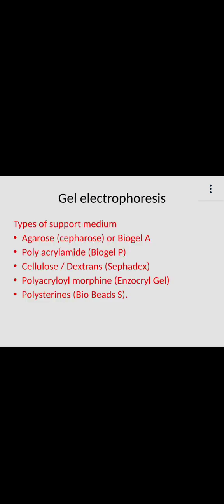So our two interests of electrophoresis, we only discuss two types, which are PAGE type of zone electrophoresis and capillary zone electrophoresis. So those are the two that we will look in detail for now.